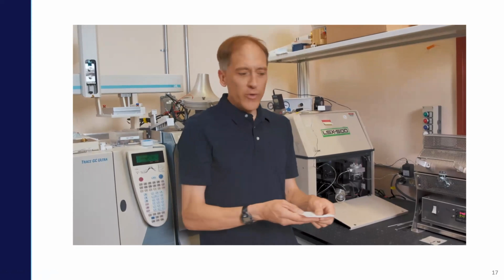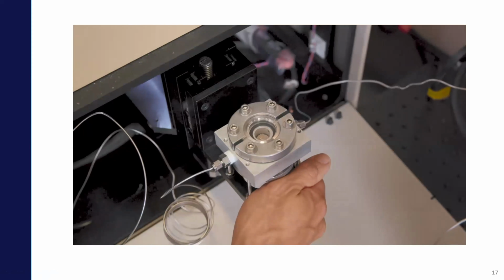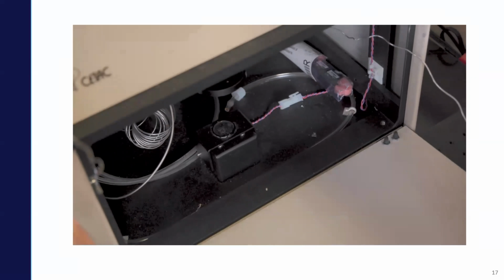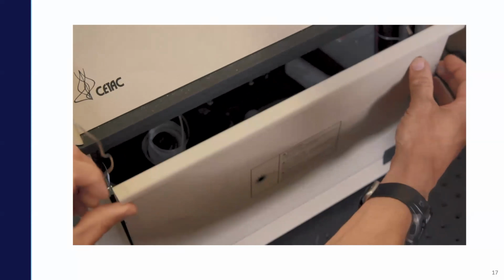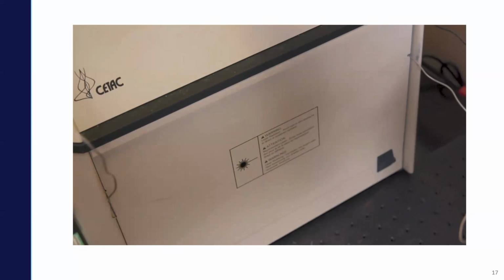Once we have our sample prepared, we can simply place it into the laser ablation chamber, close it up, slide it into the unit, close the front door, and then we're ready to visually image our sample and select the subsampling locations.